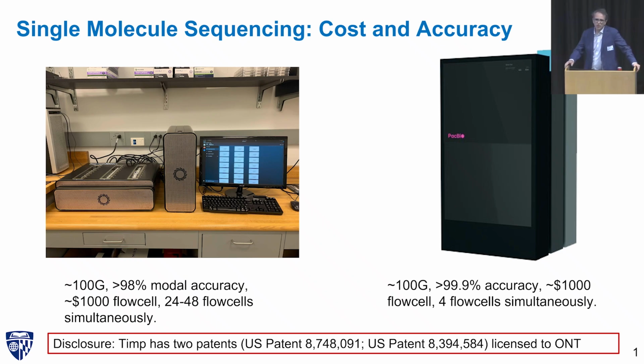So we've had a lot of sequencing technologies through the years. Obviously in the 70s and 80s, we went through Maxam-Gilbert, and Sanger came to dominate, especially with Lee Hood's integration into capillary electrophoresis with fluorosequencing, and that became very powerful. And then we had Illumina sequencing, SBS-based sequencing, competing with Ion Torrent, 454, et cetera. But I'm going to talk to you today primarily about third generation or single molecule sequencing.